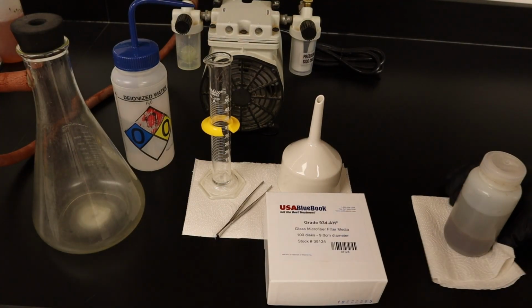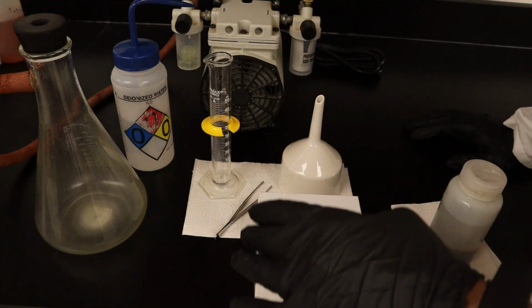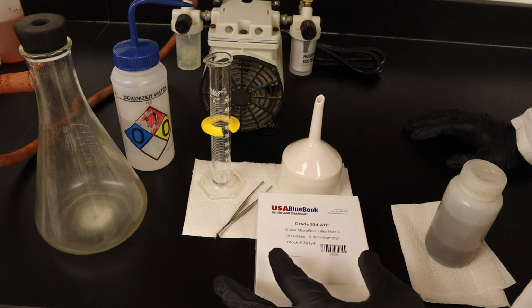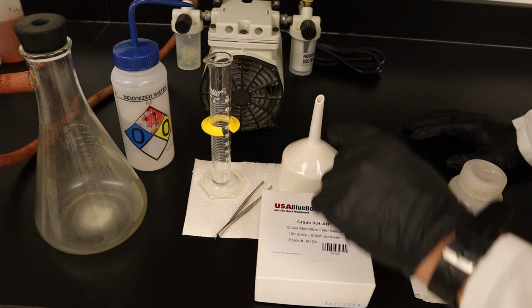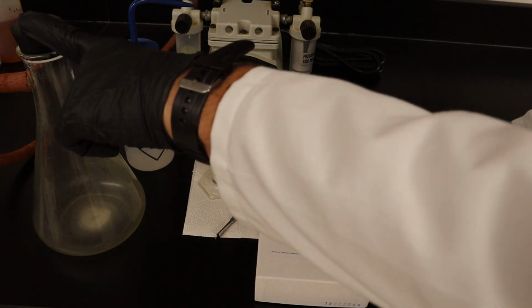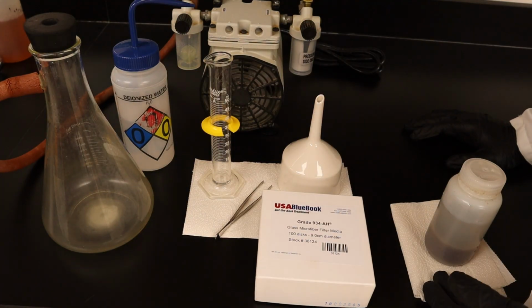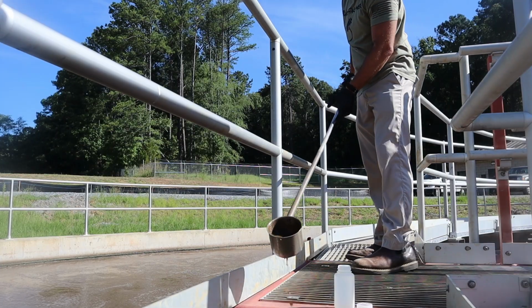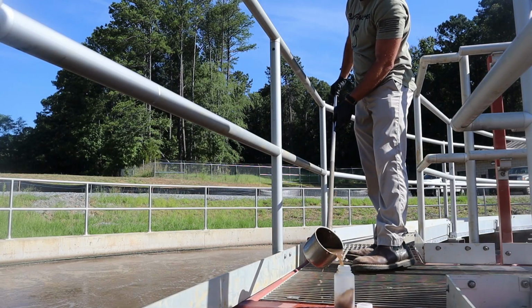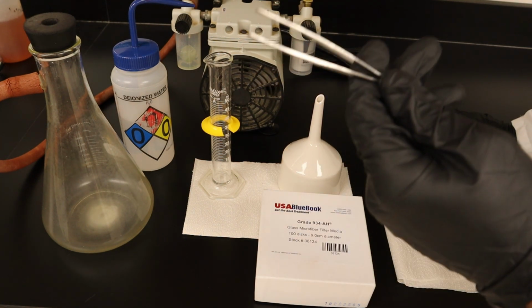Alright, Turd Nerds, here we are on the counter. So this is what we're going to be starting out with. We have our vacuum flask here, and it's hooked up to our vacuum pump. So you will need one of those. Next, I have some glass microfiber filters that we're going to be using for today's analysis. I also have a funnel which is going to attach here to the vacuum flask, and a graduated cylinder which I'm going to use to pour up my sample in. When the time is right, we're going to go over all this in the moment of actually doing it. You will also need your sample, in case you were wondering. And lastly, for this part of the video, we're also going to need some tweezers.